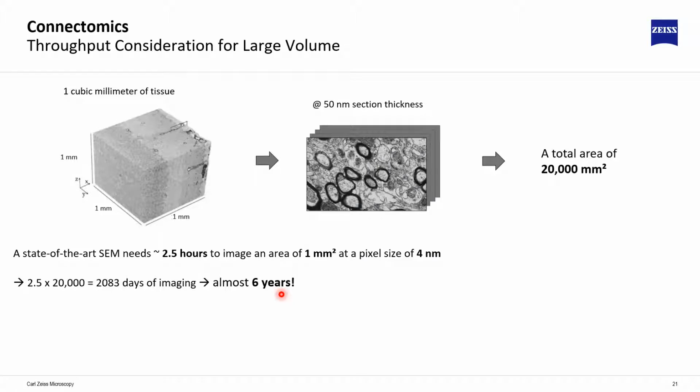That's not very enticing. That was actually quite a big challenge. You can venture out, and some PhDs will probably do that, but it's not very reasonable to have a system running 24/7 for 6 years. So that was a big problem.